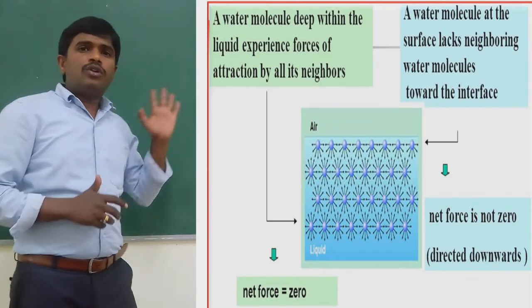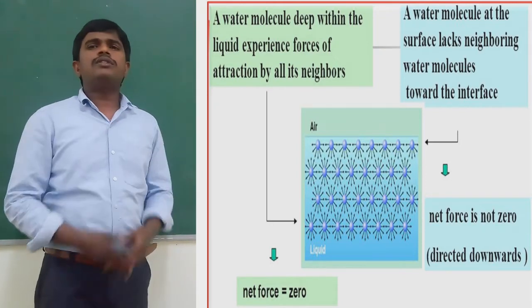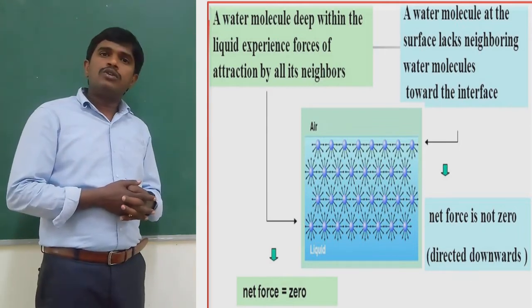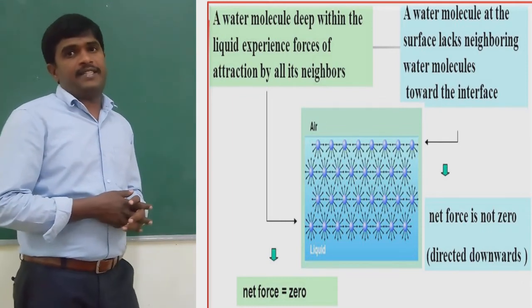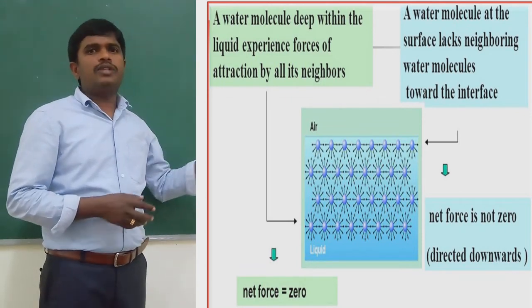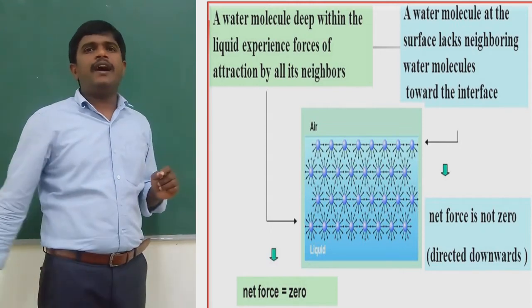So, this unequal attraction causes the water at the air-water interface to act as a cohesive force surface, and the liquid to shrink into the smallest possible surface area.